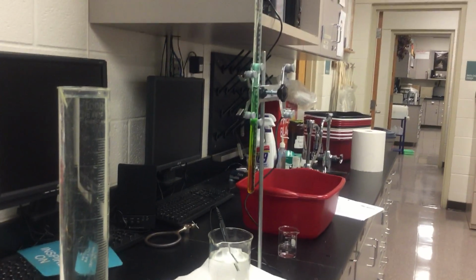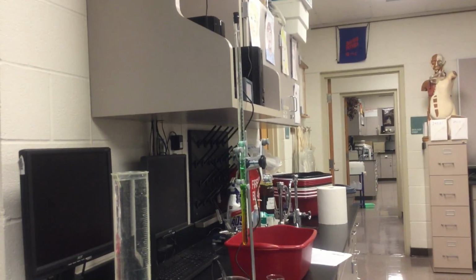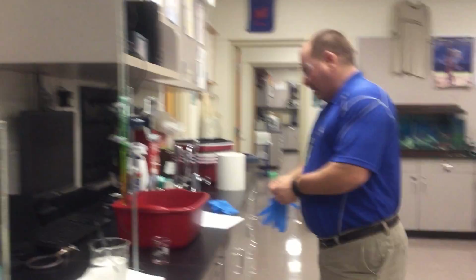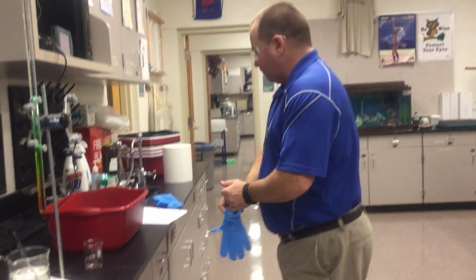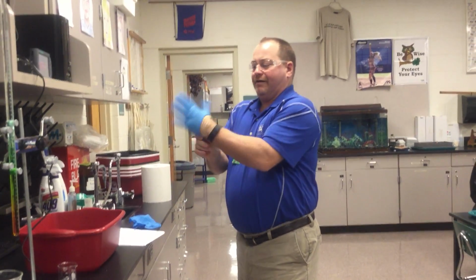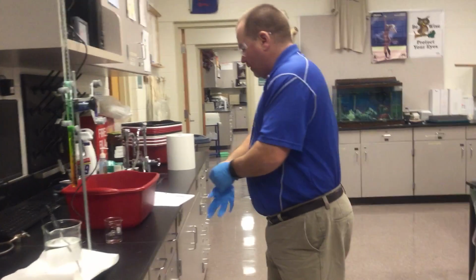I don't think it would be anything to me if I didn't have the gloves, because what you're going to see is this is going to end up being pretty diluted. Now, I've got the coil. I'm going to cover the one hole with my finger and invert this and put it into this beaker of tap water there. So I put my glove on. I don't really need to, but I'm going to.